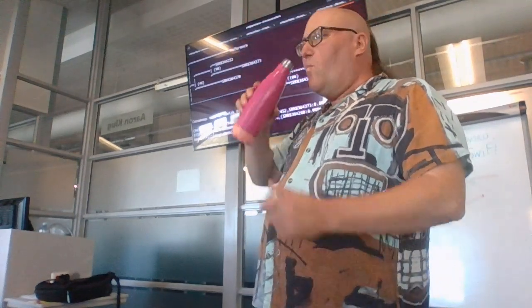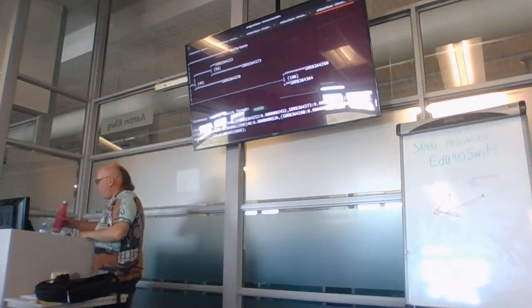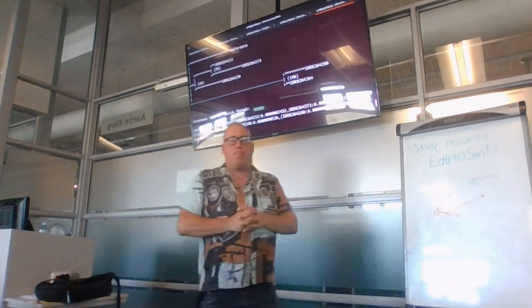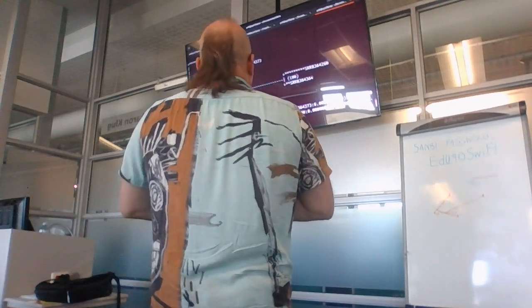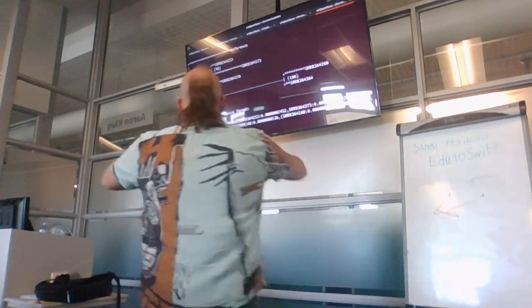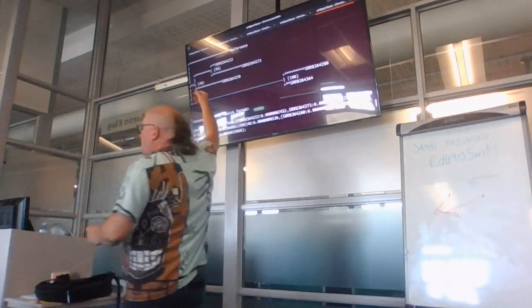So, looking at the percentages of bootstrapping, can I relate the number of mutations based on the percentages? Let me say, if I have two samples, let me compare sample 253 and 370. So it means that 370 relates to that just 40% of it. No. This is the length, but as George said, we don't have the scale bar. The length gives you how many mutations we're dealing with, but not the bootstrap values.